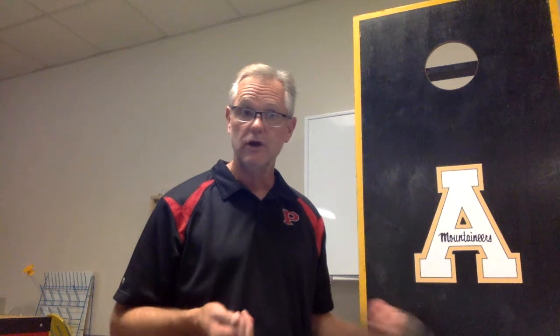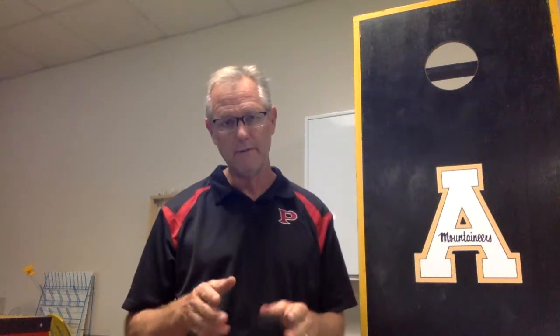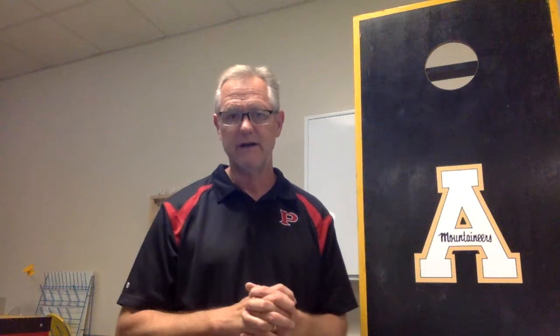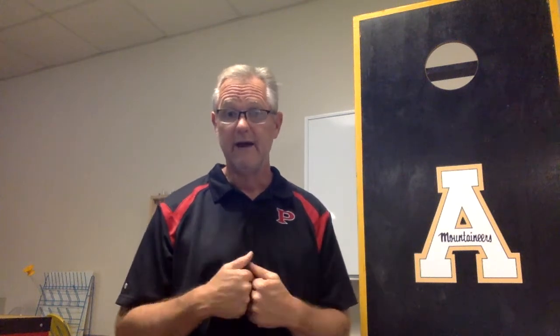So hopefully you were able to get the different color bands. If you were having trouble with them, just go back and rewatch the video, and I give you the colors of them too. And I know that's not quite as good as you being here and actually doing this, but we had to make do with what we have.